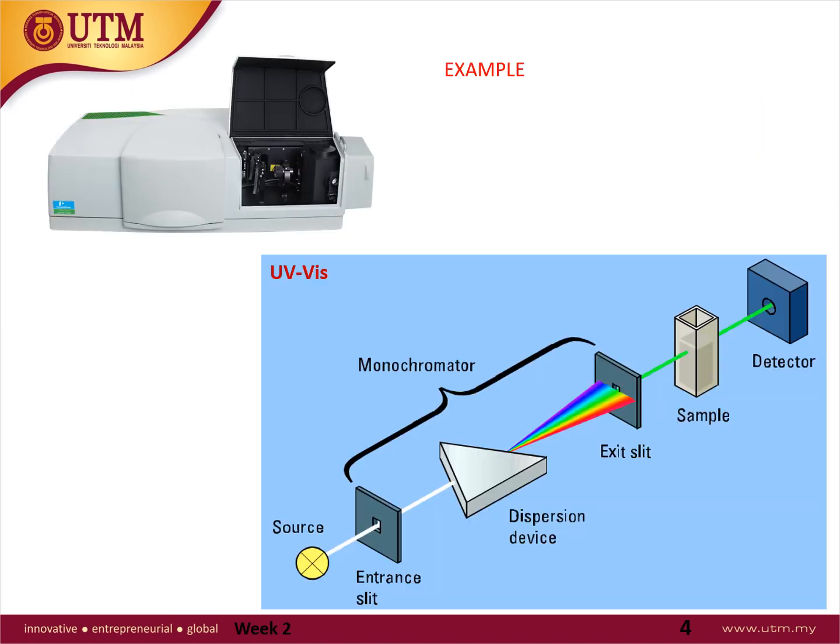For example over here, I show you the Perkin-Elmer UV visible spectrophotometer. The size is as you used in your inorganic lab before. It is the size of a computer desktop, and in the Department of Chemistry, it is one of the cheapest instruments in our department. Therefore you can see a lot of these UV visible spectrophotometers in our department.